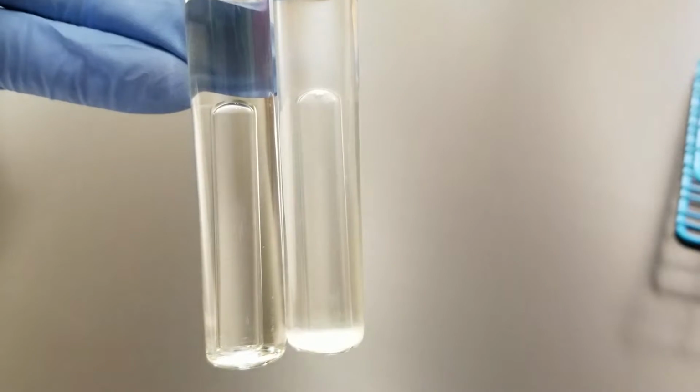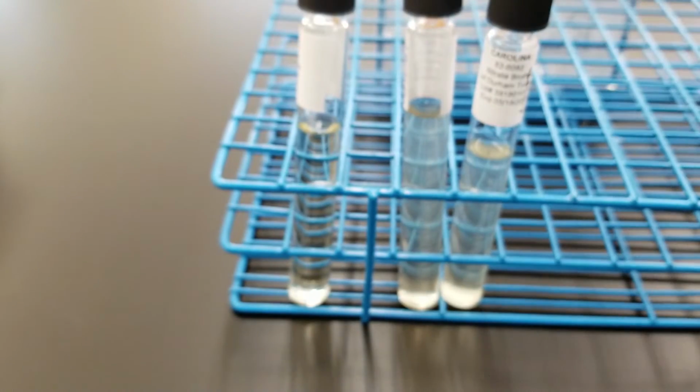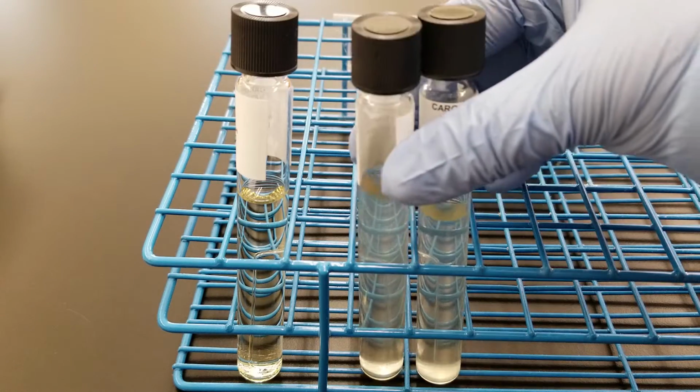So if you were doing this on non-fermenters, the GNRs, if you see gas there, that was done by some other type of process than necessarily the nitrate reduction process done by Enterobacteriaceae. Okay. So, which are fermenters, or that's in another video. Okay, so they do ferment sugars. It all depends on what organism you're talking about as to what sugars it does ferment. But anyway, so that's another test.